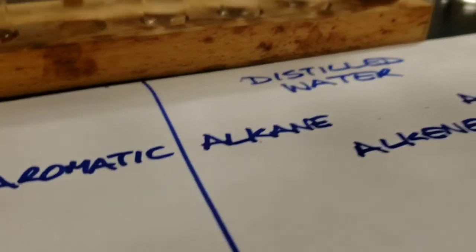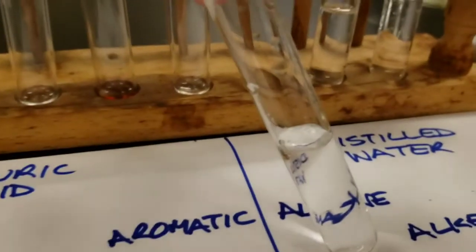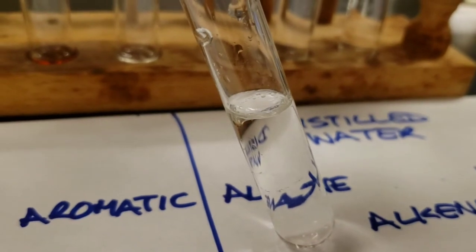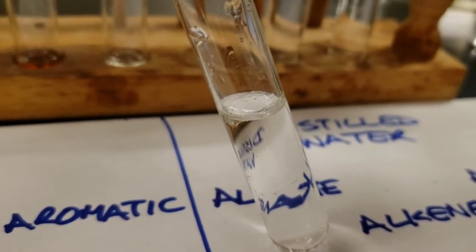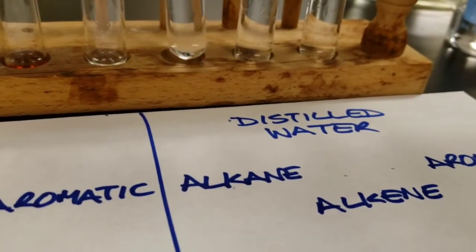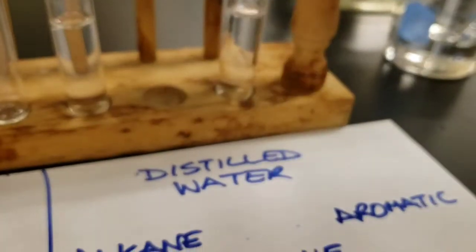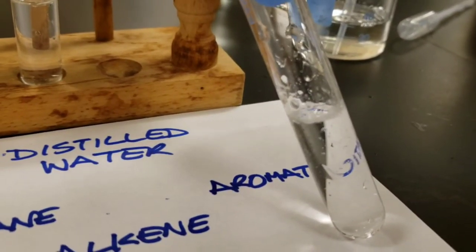If we look at the physical tests here for density with water, we can see that this test tube is bulk water with a small amount of hydrocarbon floating on the surface. All hydrocarbons are less dense than water. And that is the case with all of them.